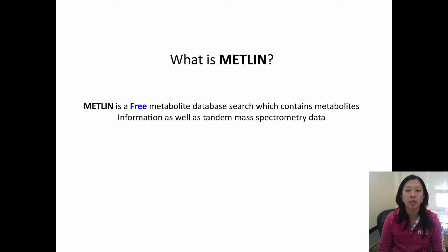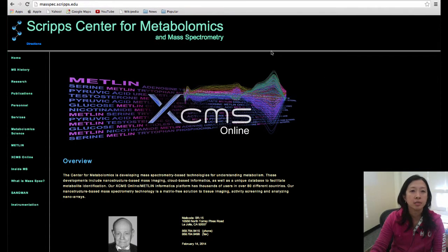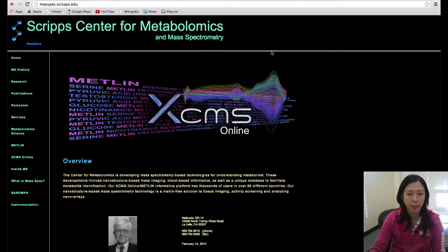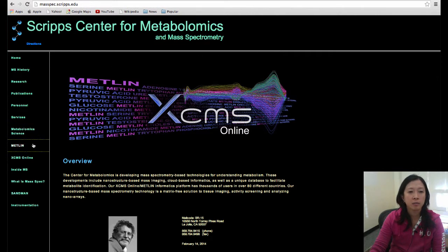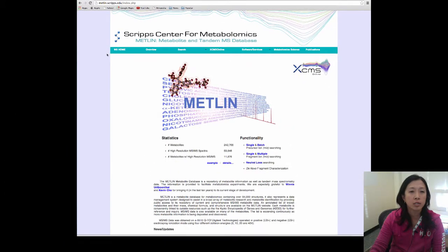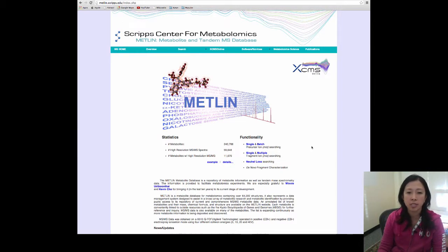It contains metabolite information as well as tandem mass spectrometry data. METLIN was created at Scripps Center for Metabolomics and Mass Spectrometry here at the Scripps Research Institute. You can access the METLIN database by going to our main web page or by typing in metlin.scripps.edu. As of today, we have over 200,000 metabolites and more than 11,000 of them contain MS-MS data.